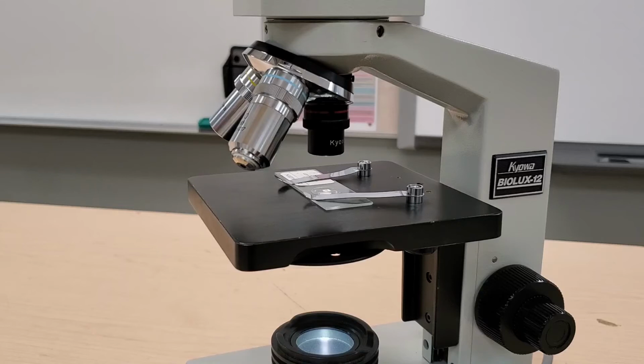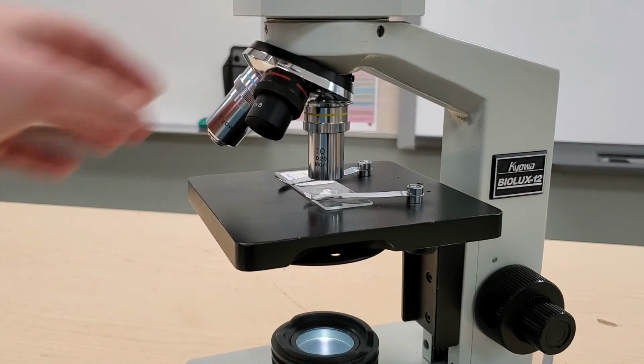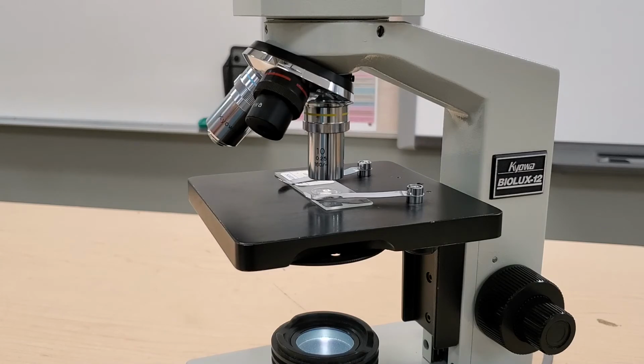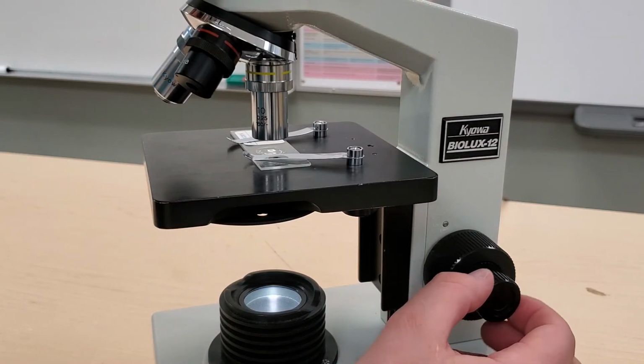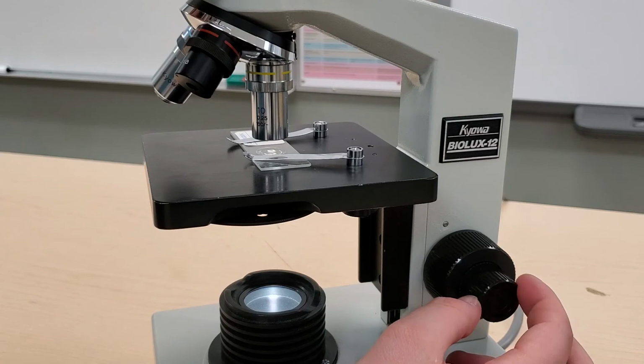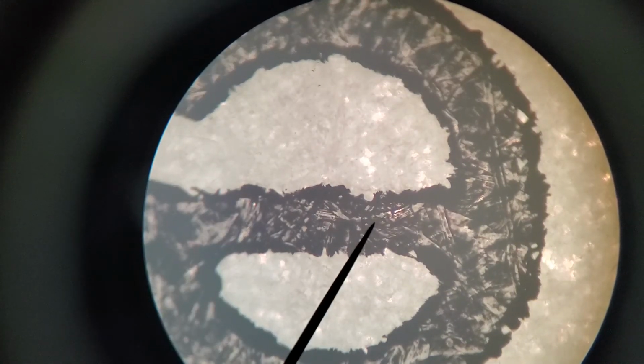When you have the object in focus on low power, you can turn the revolving nose piece to select the medium power or the 10x objective lens. If the sample is no longer in focus, only use the fine focus knob, which is the smaller one. Only use the fine focus knob to bring the sample in focus. It raises and lowers the stage more slowly, and it gives you more precision in your movement.